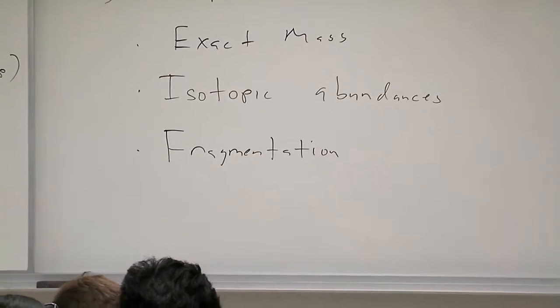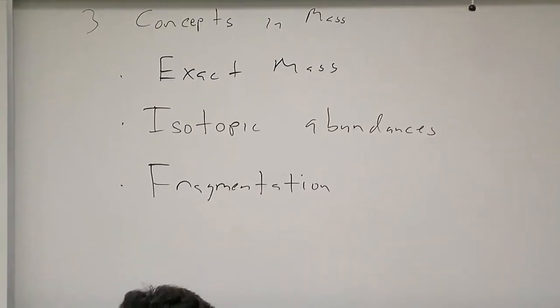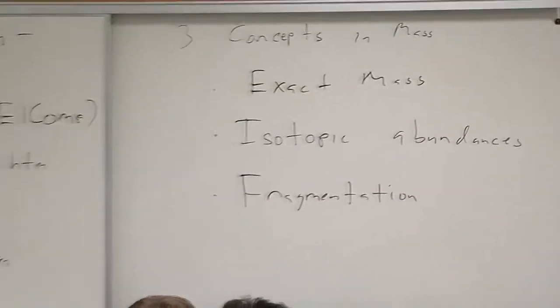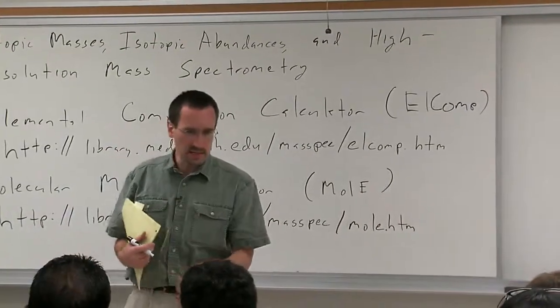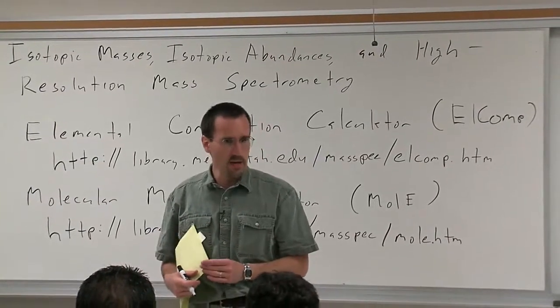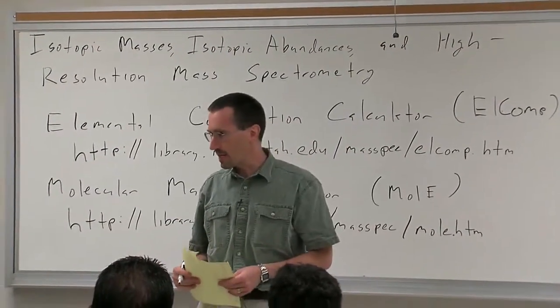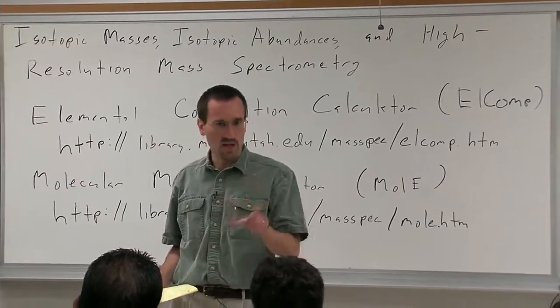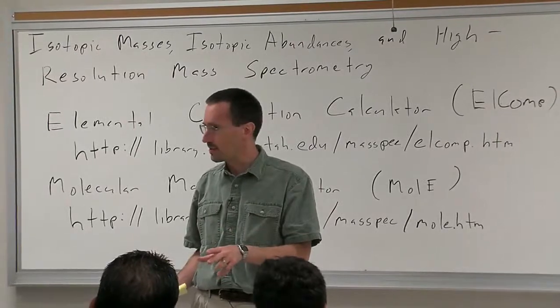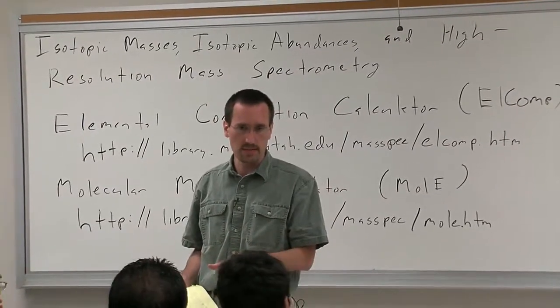We'll discuss fragmentation as it pertains to EI mass spec, which is really a subject or a special topic in its own right. We already saw, in electrospray ionization last time, an example of fragmentation of a quasi-molecular ion of a protonated species. Remember the type of molecular ion you get from soft ionization chemistry.